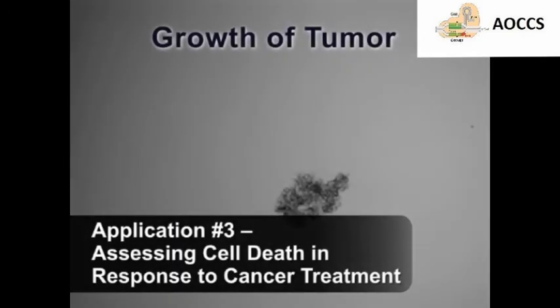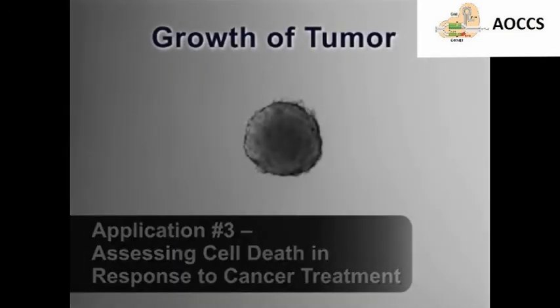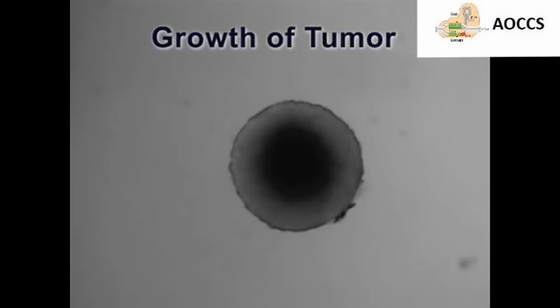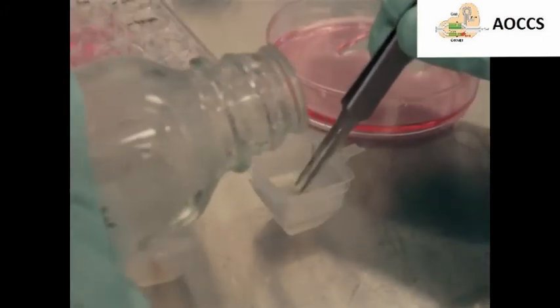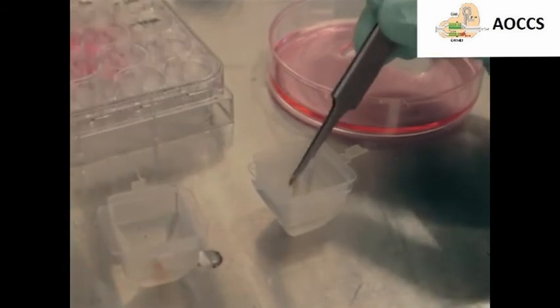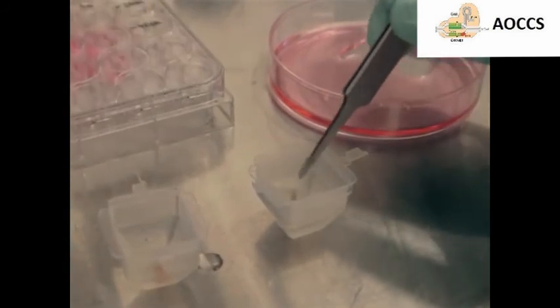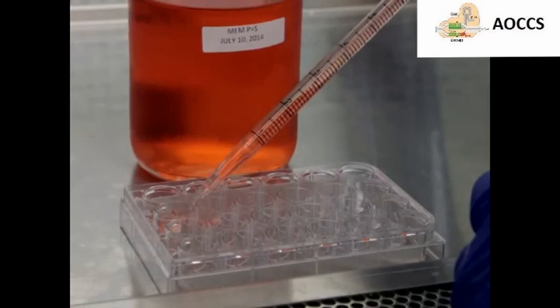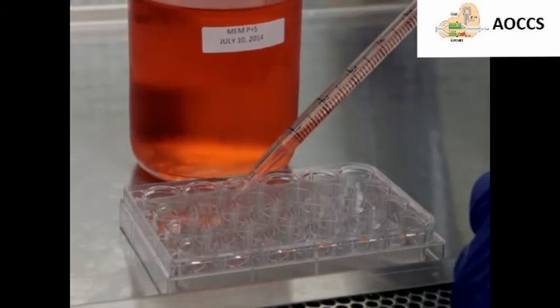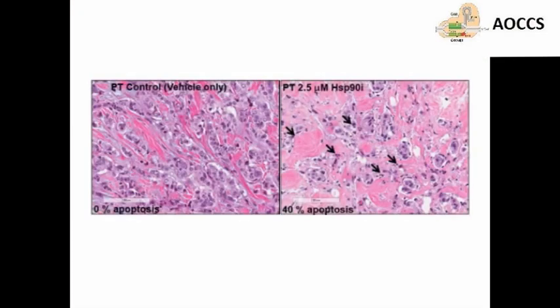Lastly, TUNEL staining can be used on human tumor samples in order to determine tumor responsiveness to drugs. In this example, tumor samples were harvested from human patients and cultured ex vivo. Next, they were treated with preclinical drugs and assessed for a response using the TUNEL assay. Data obtained show that treatment with a drug that inhibits heat shock protein 90 significantly increases apoptosis in tumor tissue.